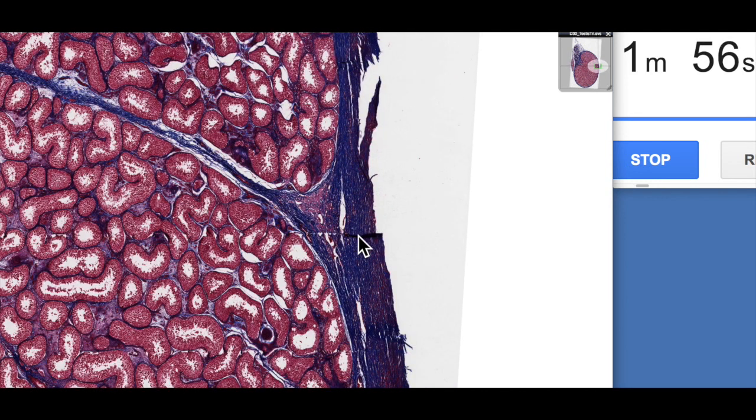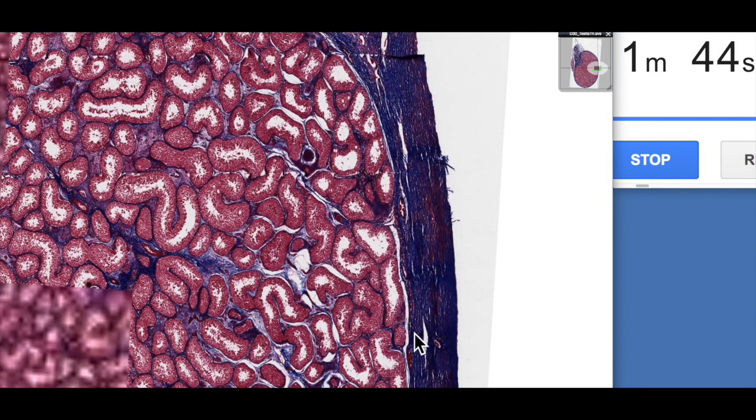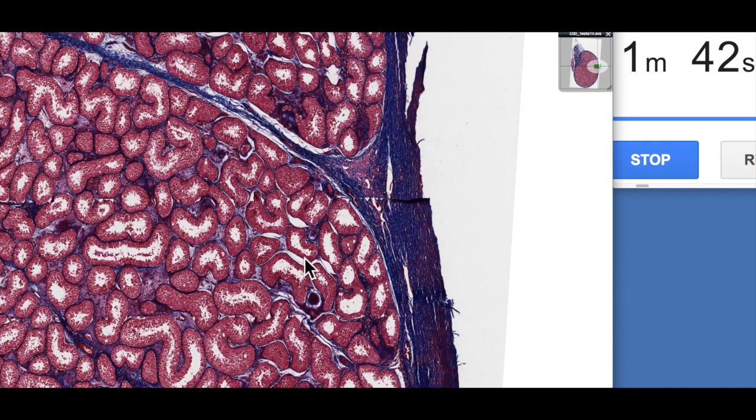Now the tunica albuginea plays an important role in the structure of the testis, but it also throws in these connective tissue septa. You can see one of these septa here. And what the septa do is divide the testis into lobules. And within each lobule you have two to three seminiferous tubules.